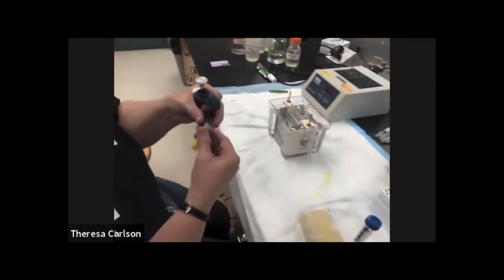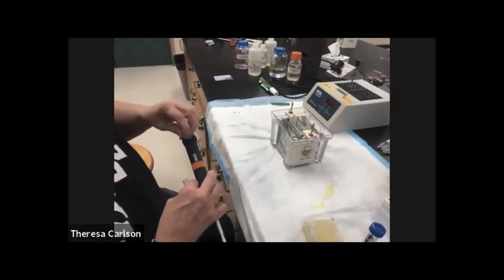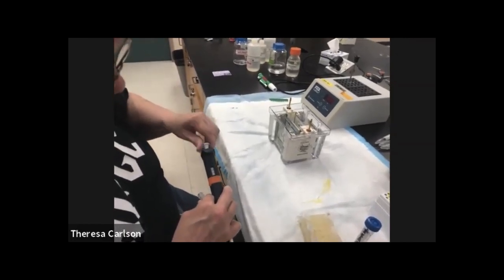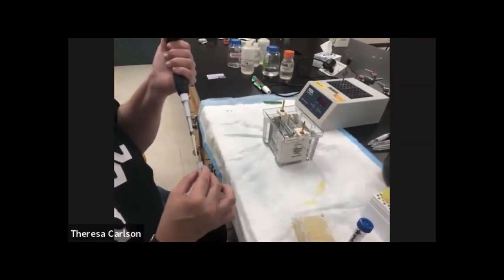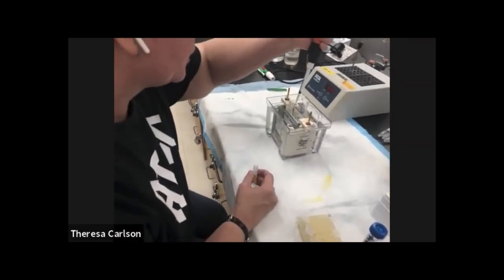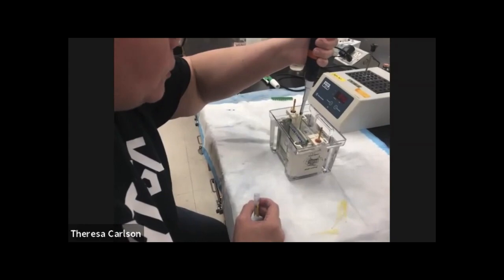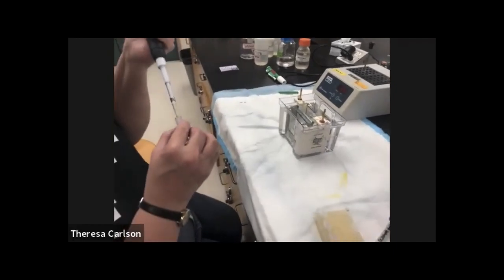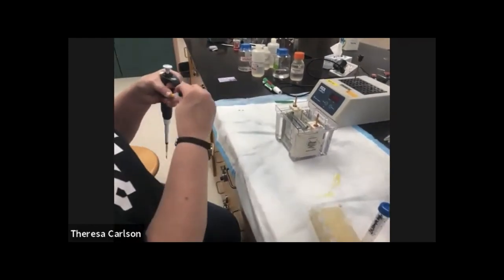And then we're going to have a marker. The marker has specific colors in it at certain sizes to allow you to identify which bands belong to what sizes. One of the overall purposes of running things on an SDS gel, besides being able to spot how many proteins you have and follow the level of purification that way, is that we want to be able to tell what size is a single subunit of aldolase. Remember that aldolase is a multi-subunit protein, and one of the goals of the experiment is to be able to identify how many subunits are in aldolase.